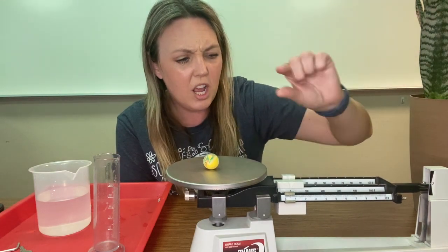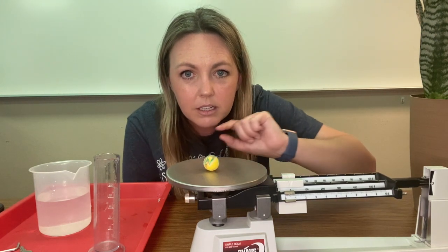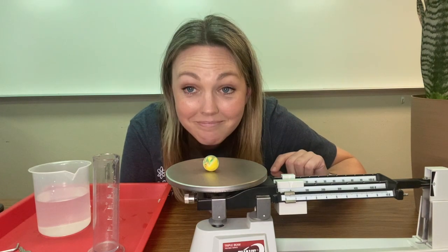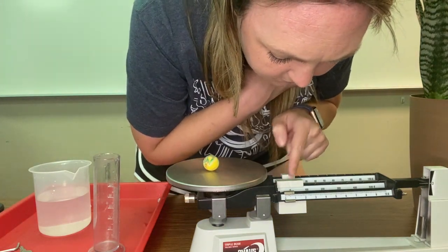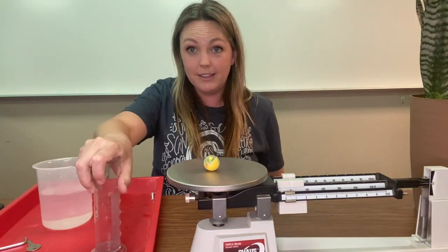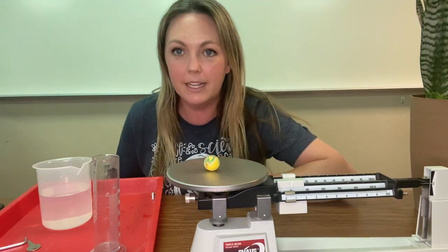All right, so it is just over 10 grams. We've got 10 and one, two, three, four — 10 and four tenths grams. This bouncy ball is 10 and four tenths grams.